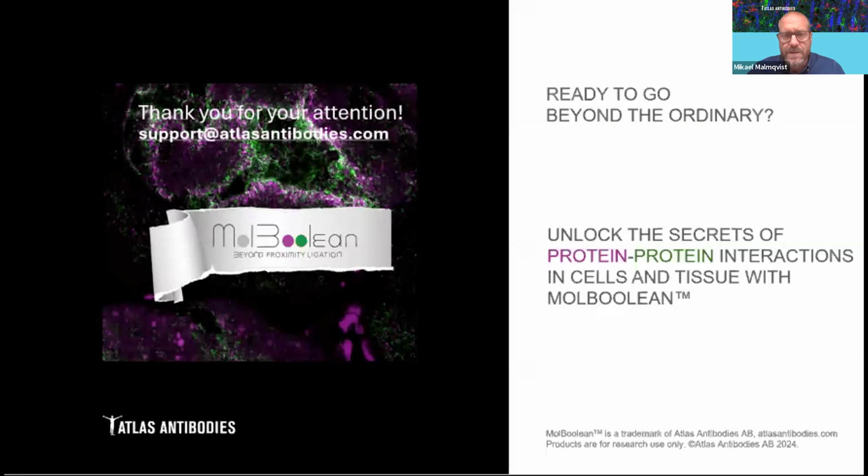And I think you already touched upon this. Does antibody binding affinity affect the method? And you answered already, right? It does affect the method. So you need to have primary antibodies with a good binding affinity.